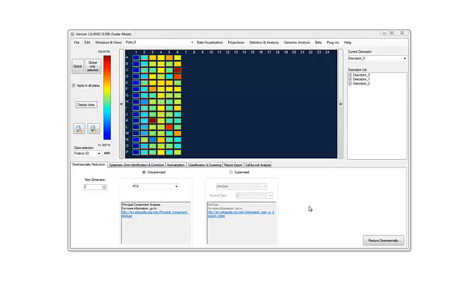Welcome to the HCS Analyzer tutorial. Today's tutorial is about the user interface of the software. I will quickly describe all the different windows and different options that you can have when using this software.